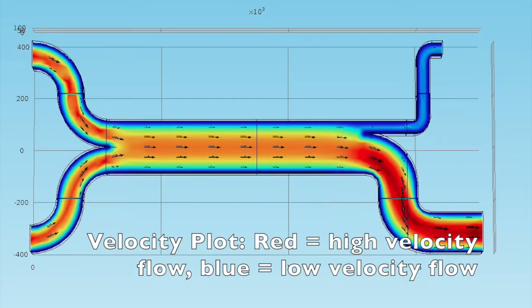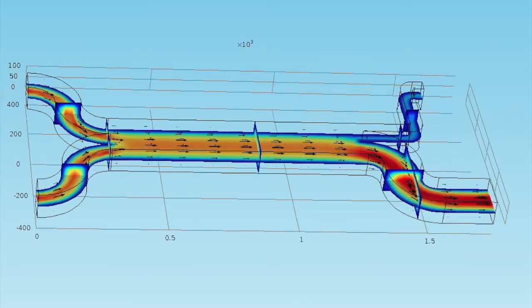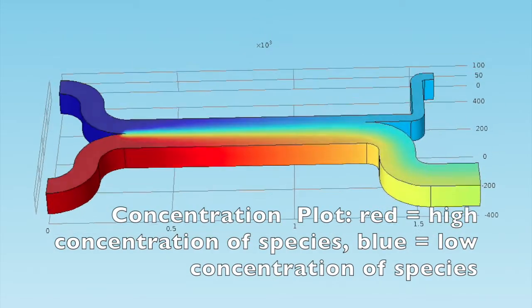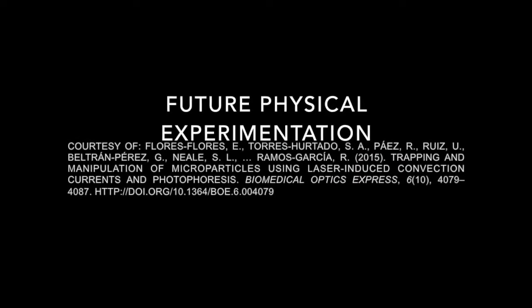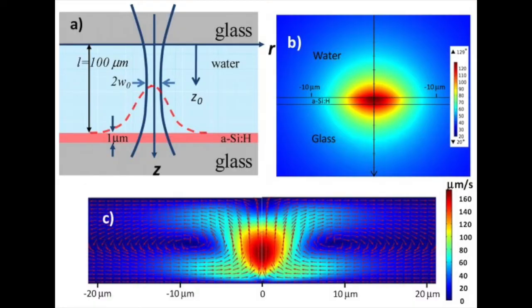After both the fluids have been injected into the channel, at the interface between the fluids, diffusion naturally occurs for any particles present, and net movement will occur from areas of higher concentration to lower concentration. In this case, there will be a net flow of particles out of the blood layer and into the buffer layer. The laser source, typically in the range of 540 to 550 nanometers, is projected towards the channel favorably to the side of the channel where blood is injected.